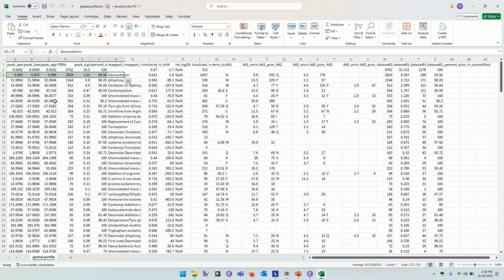So you can get some really weird stuff from it, but the upshot, I mean, you didn't think it would be a big story. It's 1 Dalton, right? But here it is. 1 Dalton can occur because asparagine and glutamine are doing silly things. Okay. So the gain of 1 Dalton could come about because of making a mistake of picking the monoisotope in the MS1 scan, or it can come about in the case of an N or Q that's getting adventurous. Either of those will take place.